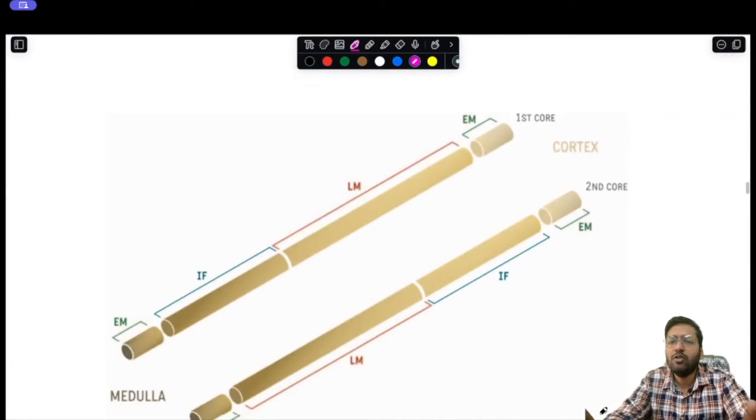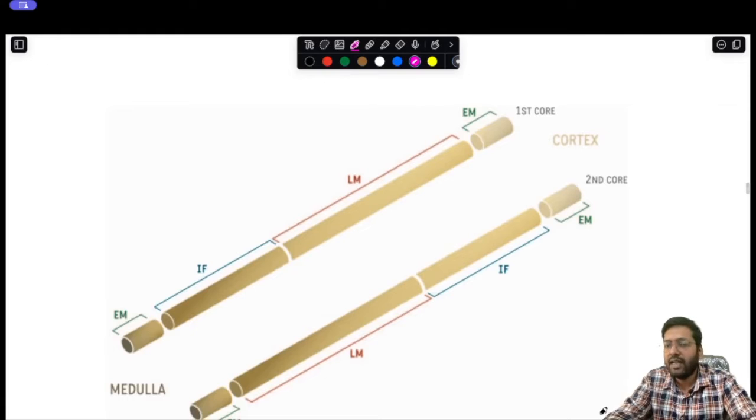Now, I just wanted to show you that in different boards, like the American Society of Nephrology, they also have another way of dividing. What I have discussed is from a pathological point of view. From a nephrology society, or from the medicine people, they have some other idea of dividing the core for examination. Even if some examiner says this is also right, there is no generalized acceptance to the way you have to divide the core.